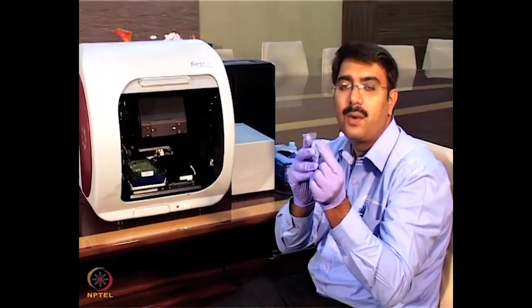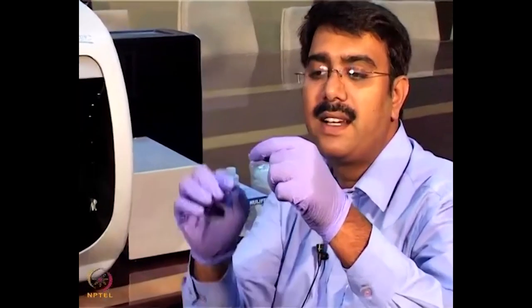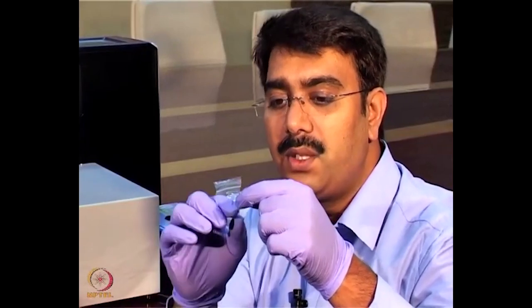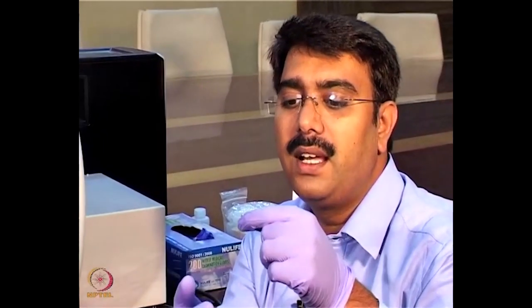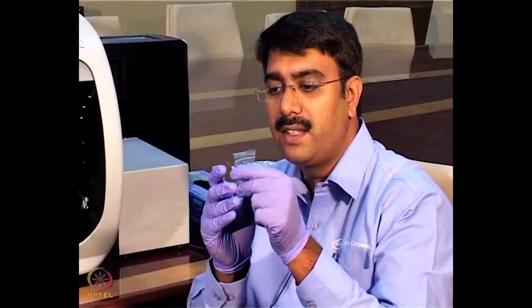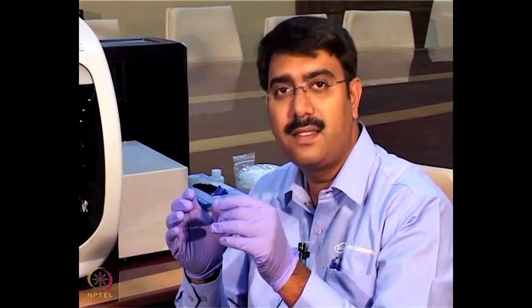At the tip of the sensor we put the ligand of our interest. We pass a white light and the light gets reflected back. It is a reflection based phenomenon. One light comes from the internal optical layer, another light comes from the ligand end. So when there is an interaction between the two binding partners, suppose I am coating a matrix, protein A. When you dip the sensor into the corresponding binding partner, for example a monoclonal antibody, when human IgG starts binding to the protein A matrix, as you know, it is concentration dependent. As more molecules bind to the protein A matrix, we can see a change in the spectrum, that is, a change in the wavelength.